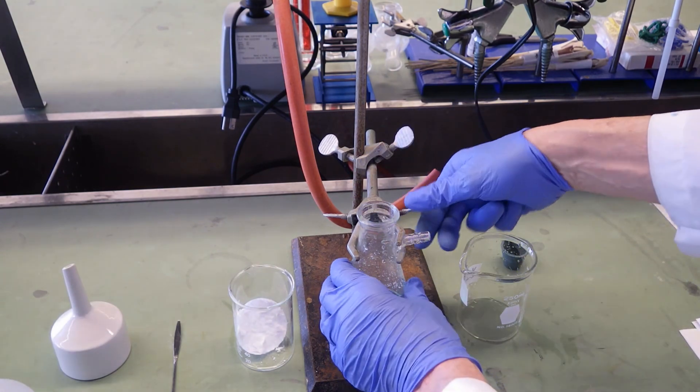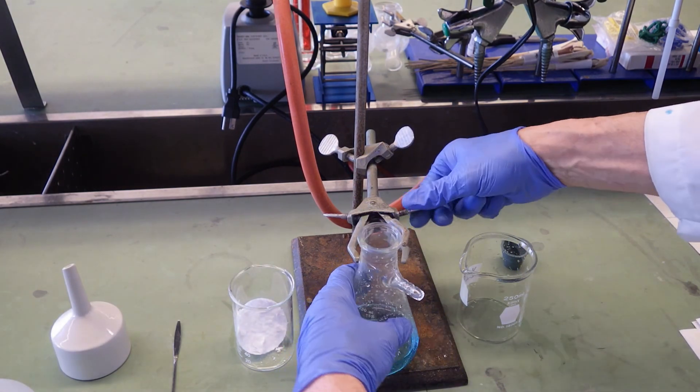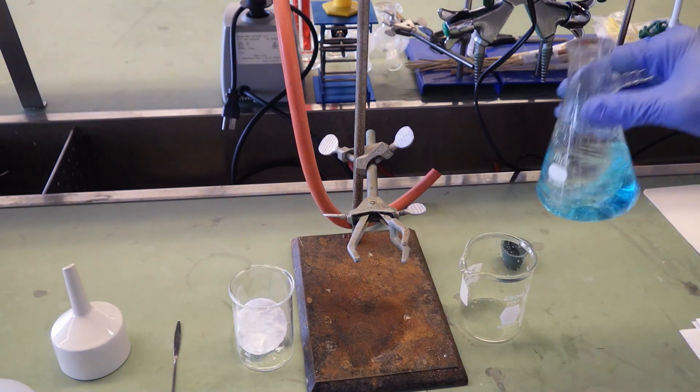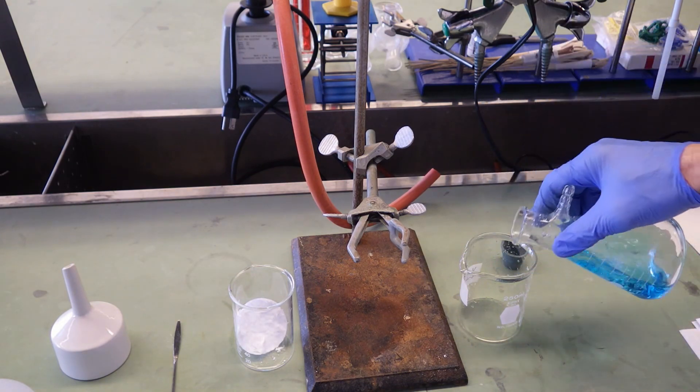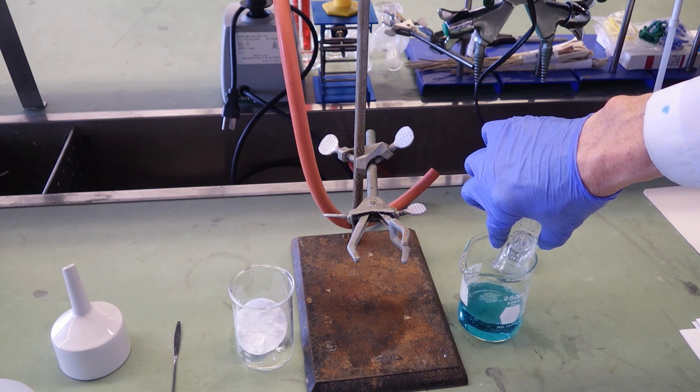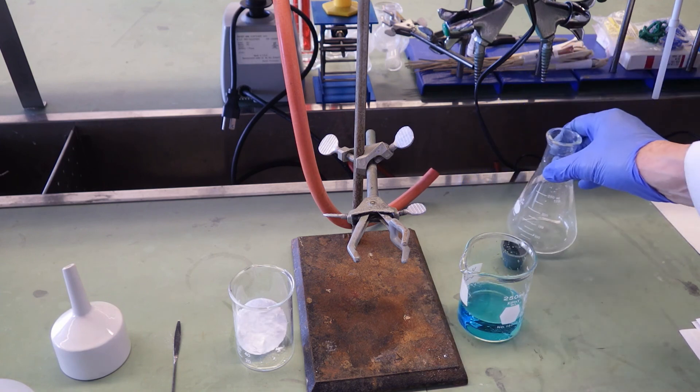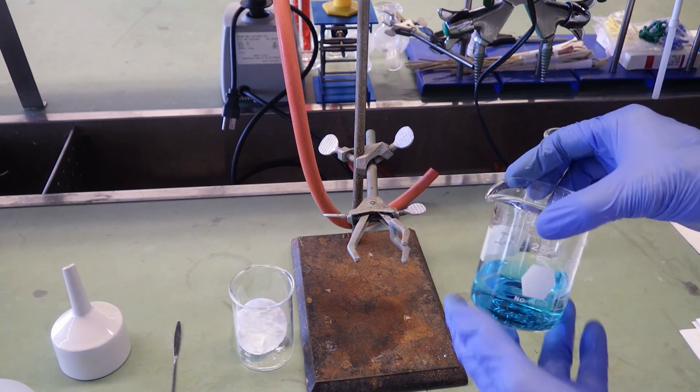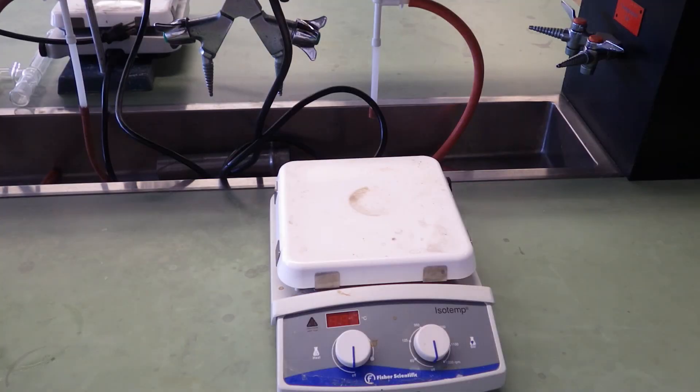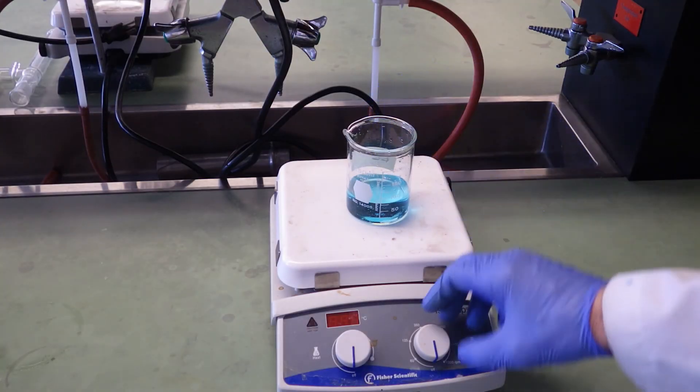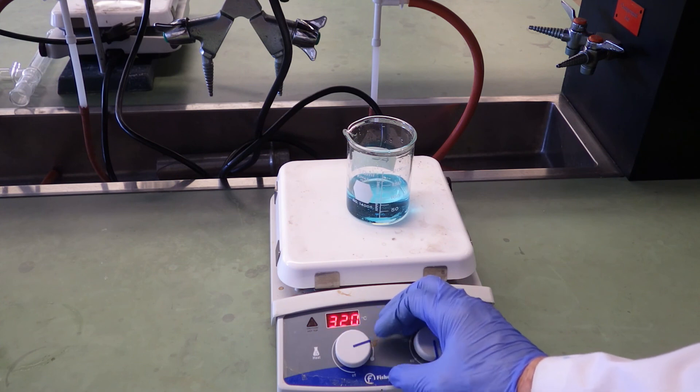Now the filtrate—we'll transfer that to a beaker and boil it down on a hot plate to about 15 milliliters, get rid of the bulk of the water.